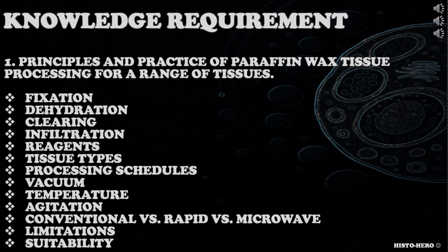When addressing this knowledge requirement, candidates should consider fixation, dehydration, clearing, wax infiltration, reagents used, various tissue types and their processing schedules, various factors that affect processing like vacuum, temperature, and agitation, conventional versus rapid versus microwave processing, limitations of processing, suitability of wax processing, and so on.